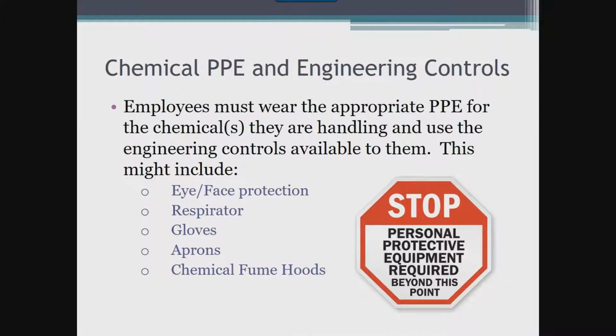Depending on the chemical that they are working with, the staff will want to don particular types of PPE. This could be limited to gloves and eye protection. The chemical might require an impervious gown, and some chemicals require respirators to be worn. There are chemicals that must be used under a chemical hood, which is a type of engineering control. It is important to note here that a biological and chemical fume hood are 2 different types of equipment. It is important for staff to understand which hoods are suitable for chemicals.